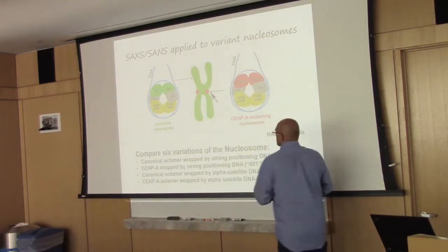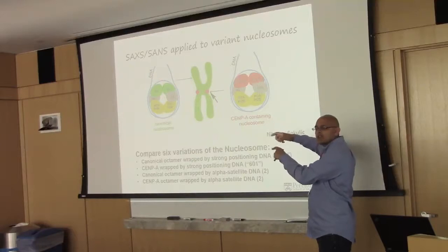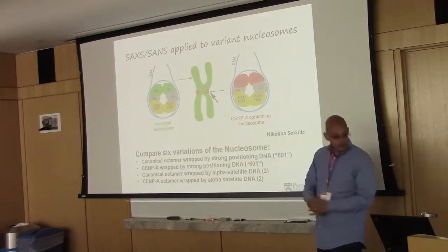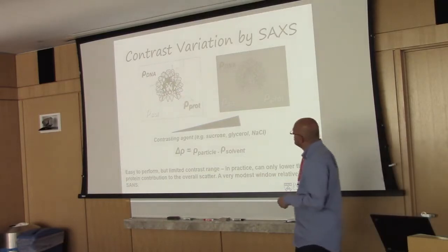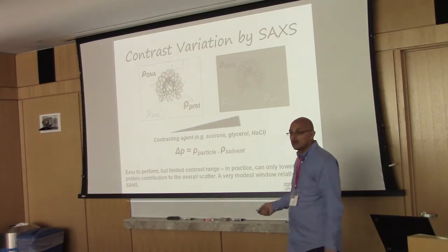So we want to ask a question: if you mix and match different histones and different DNAs, which combinations, if any, were different in solution, and how do they compare with their crystal structures? You can go about this a couple of ways, and we tried it both ways. You can do the X-ray experiment where you contrast with, in our case, sucrose.